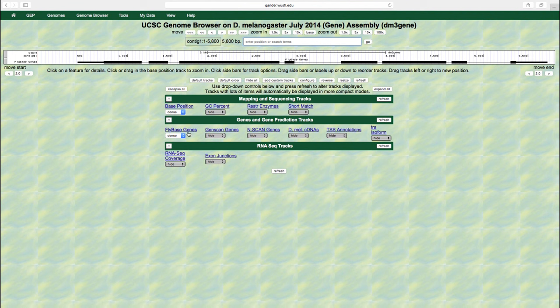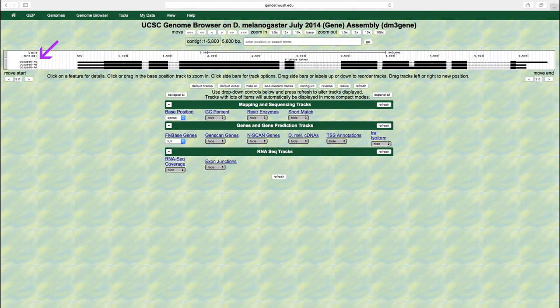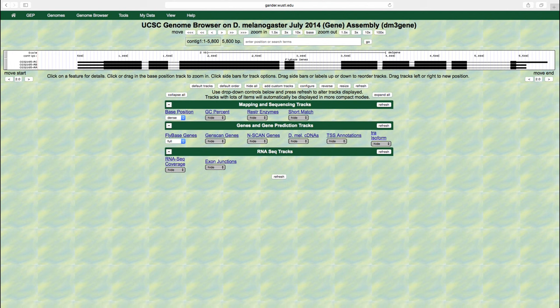Change the display mode for the fly-based genes track to full and then click on the refresh button. Now we can see that there are three sets of exons and introns that correspond to the three isoforms of the gene CG32165. An isoform is an alternative form of a gene that results from alternative splicing, or the use of different sets of transcribed exons in the processed mRNA. Each isoform of a gene has a different mRNA sequence. However, some isoforms may have the same amino acid sequences because they use the same set of coding exons.